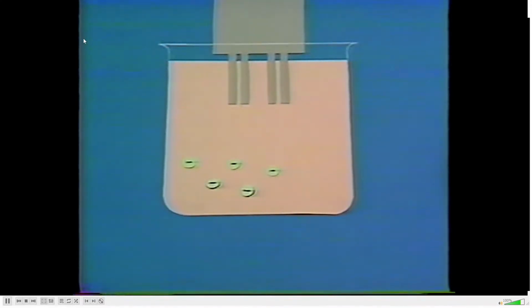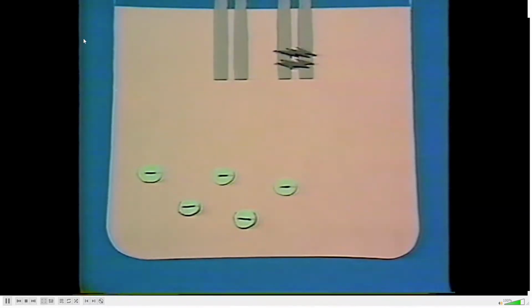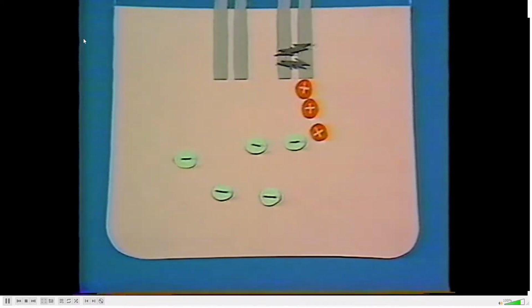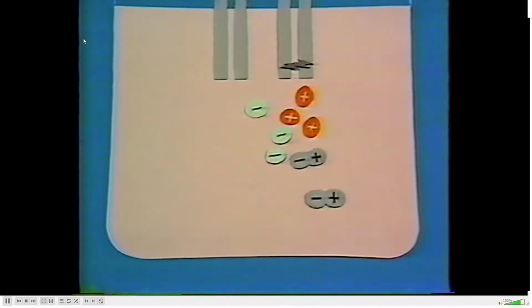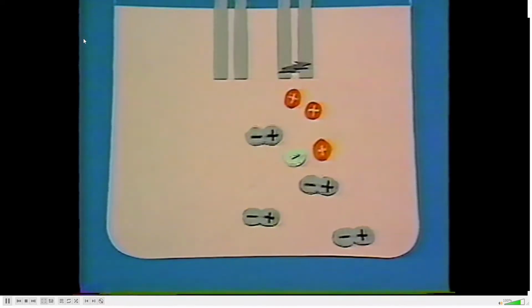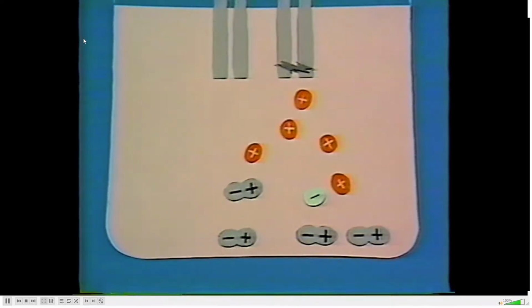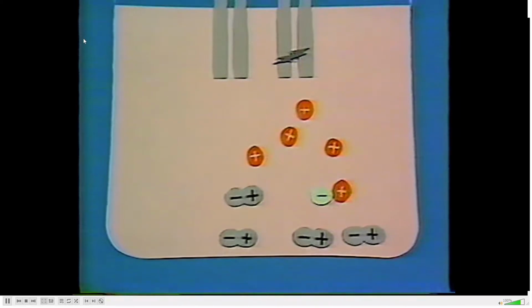With this titration, a constant current is applied across silver electrodes. One electrode is the generator electrode and is physically consumed as silver ions pass into solution while current is applied. Free chloride ions in a test solution combine with the silver ions given off at the generator electrode to form the silver chloride precipitate. The rate of release of these silver ions is kept constant. When all the chloride has been precipitated, an equivalence point is reached.